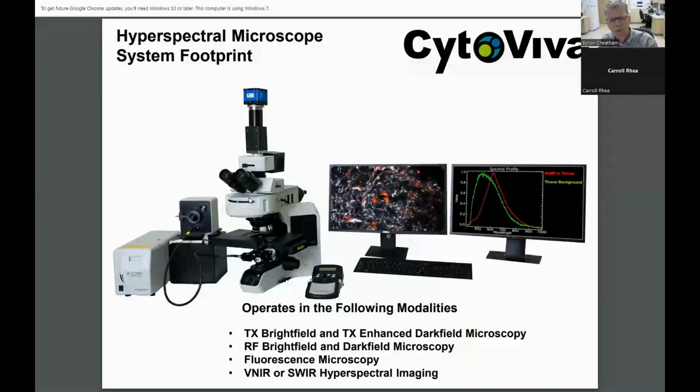We'll talk about how that works. On the dual port camera mount of the microscope, we have two systems. The first system is the spectrograph and sCMOS camera that are integrated together to create the spectrophotometer that creates the image that has the spectral data in every pixel. Behind the dual port here, we have a standard research grade optical camera.